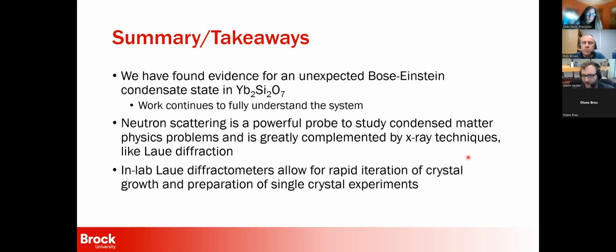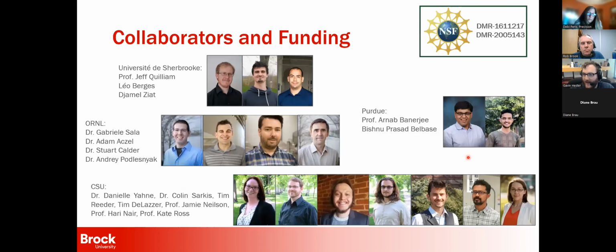And then, yes, I've already said this, but these in-lab Laue diffractometers, like the one Photonic Science builds, allow for rapid iteration of crystal growth and preparation of single crystal experiments like the ones I showed you today. And so with that, I just want to thank all of the wonderful people who over the past 7 years have helped enable this work and take it to papers and things like that.